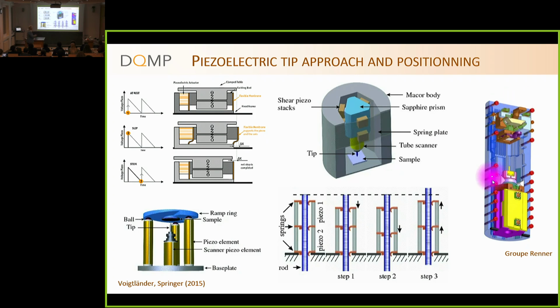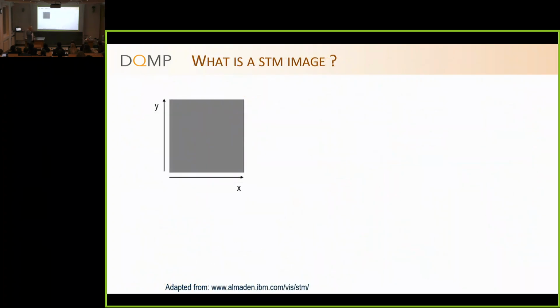And in addition here, you can rotate the tip around its axis, which, if you remember the spin and orbital contrast, is something we hope can give us an additional degree of freedom to control that.